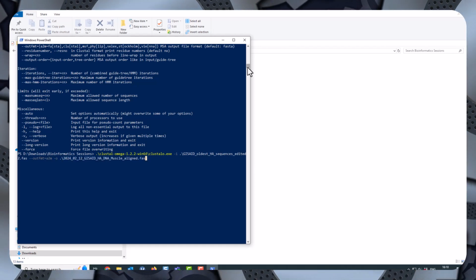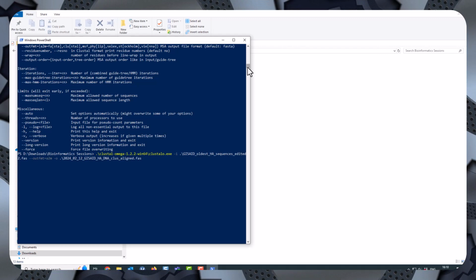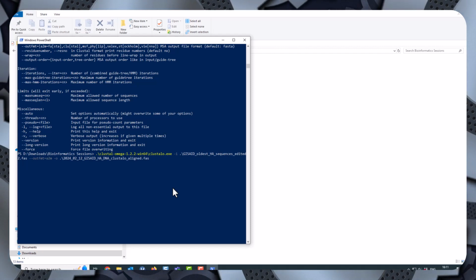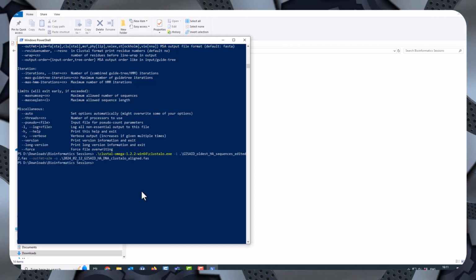Then I do the output file, the name of the output file. Again, it's just automatically generated the name, and I need to edit it because I need definitely to tell this is the Clustal-Omega output. I don't want to write over the file that I've already done correctly, the muscle one, with my Clustal-Omega output. So I need to make sure that it systematically has a different name. The muscle aligned sequences say muscle aligned in their file names. The Clustal-Omega say Clustal-Omega aligned. It doesn't give me any hint about what the process is like you get in muscle. It's just doing something and the cursor's flashing, and then suddenly you get it back.